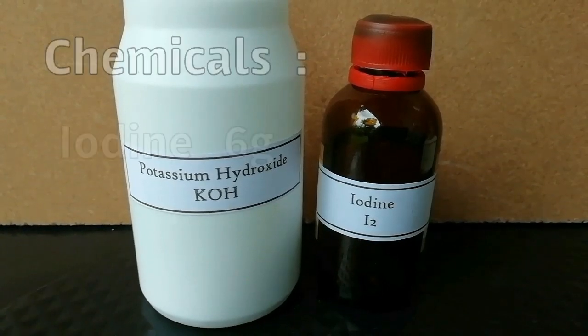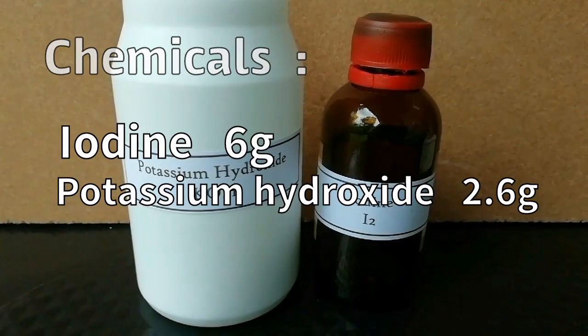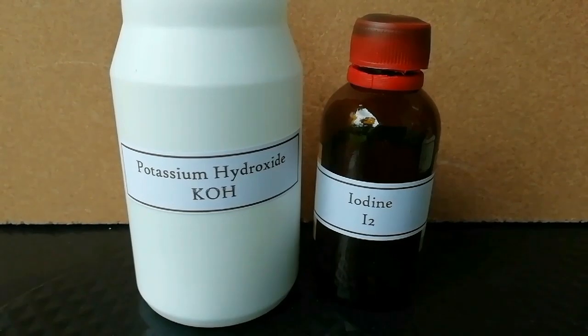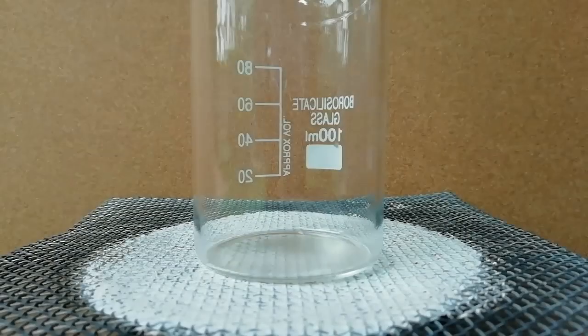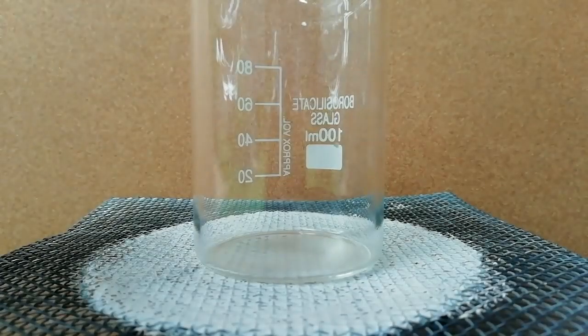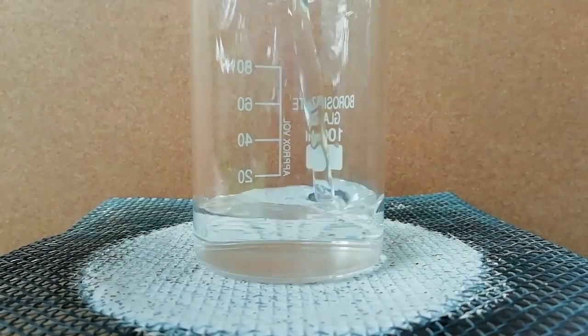For this reaction I used 6 grams of iodine and 2.6 grams of potassium hydroxide. Normally potassium iodide is a very expensive chemical, but making potassium iodide from iodine and potassium hydroxide is very cheap.